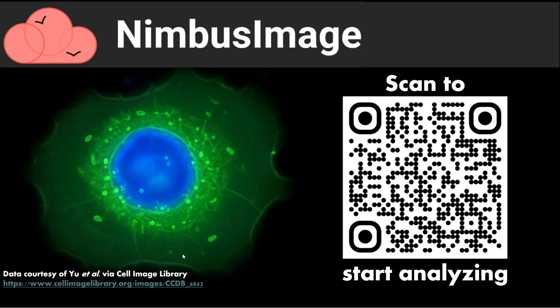So if you'd like to analyze this data set, you can access all this data. It's publicly available via Cell Image Library via this link. Or you could use this QR code to start analyzing your own data in NimbusImage.